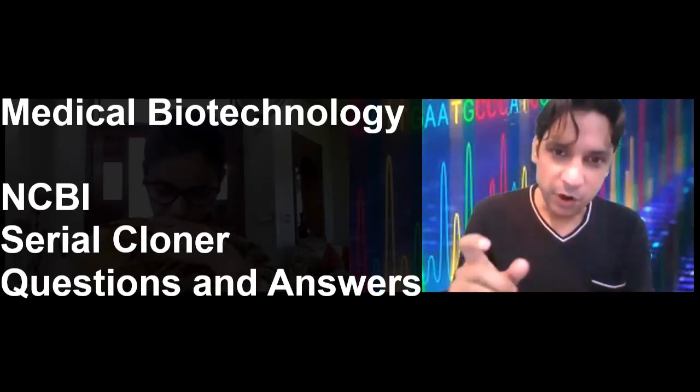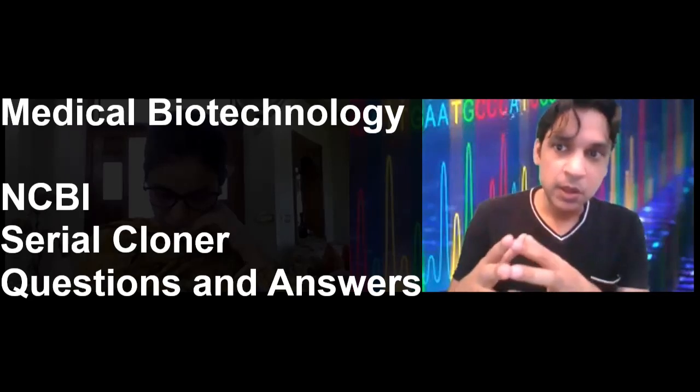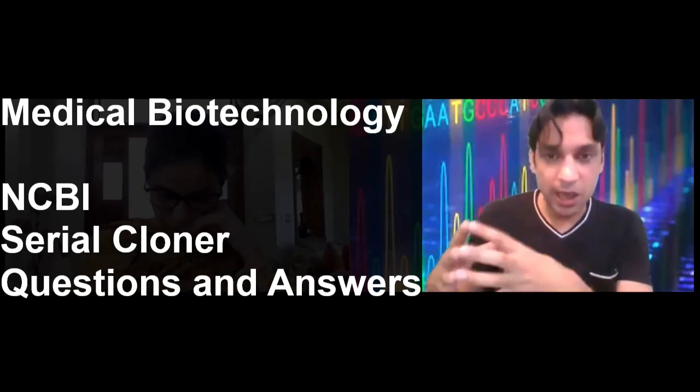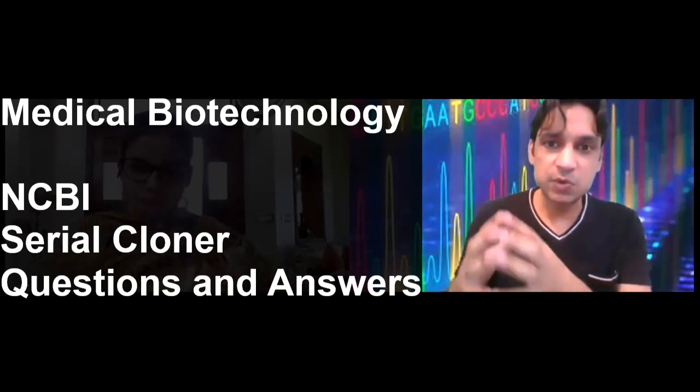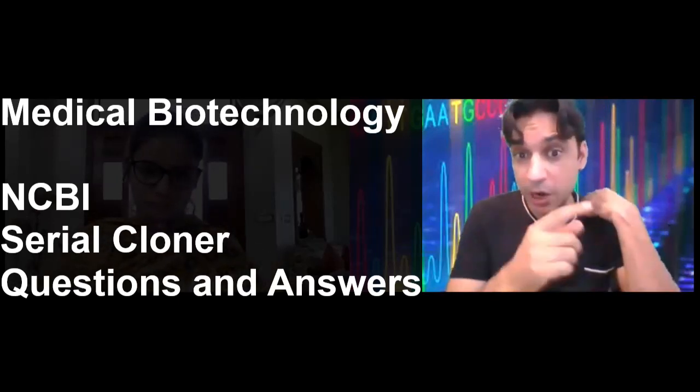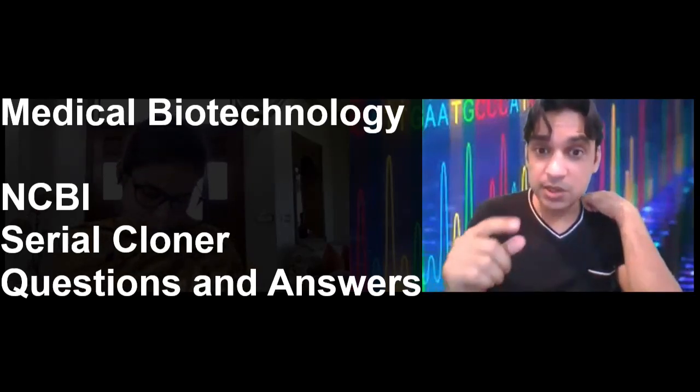That is called a format. तो फास्टा फॉर्मेट is one of the formats. GenBank is another format. cDNA सीक्वेंस जो है ये और है, जो मैंने बताया आपको कि प्रोटीन कोडिंग पार्ट ऑफ द जीन जो है वो cDNA सीक्वेंस होता है. There are multiple formats to write the sequences, nucleotide sequences in different ways.